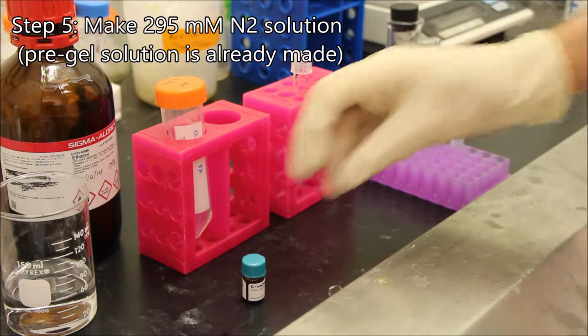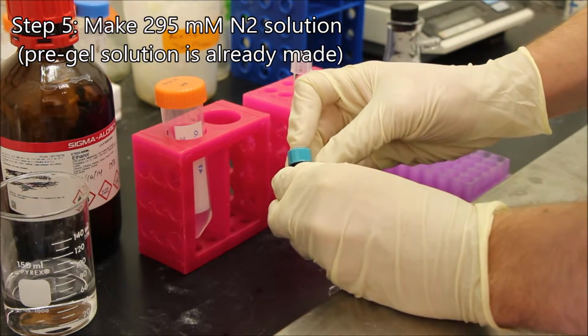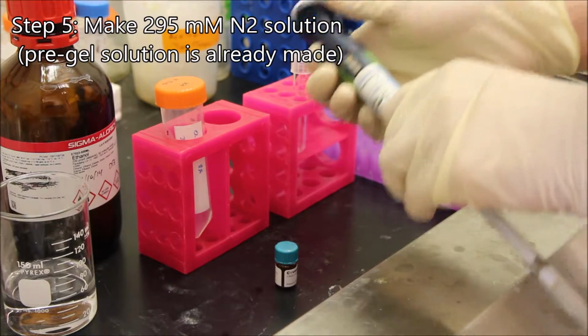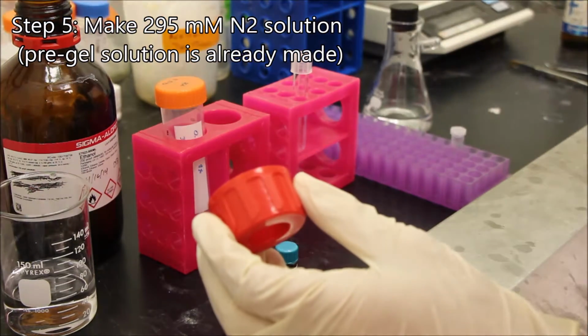Alright, so we're going to start by taking our N2 molecule, which is an acrylamide NHS. It allows us to functionalize the gel. We're going to take 300 microliters of molecular grade ethanol.